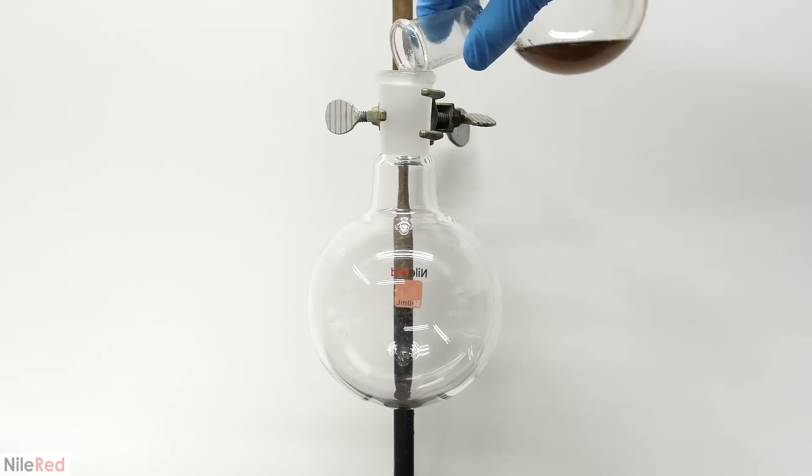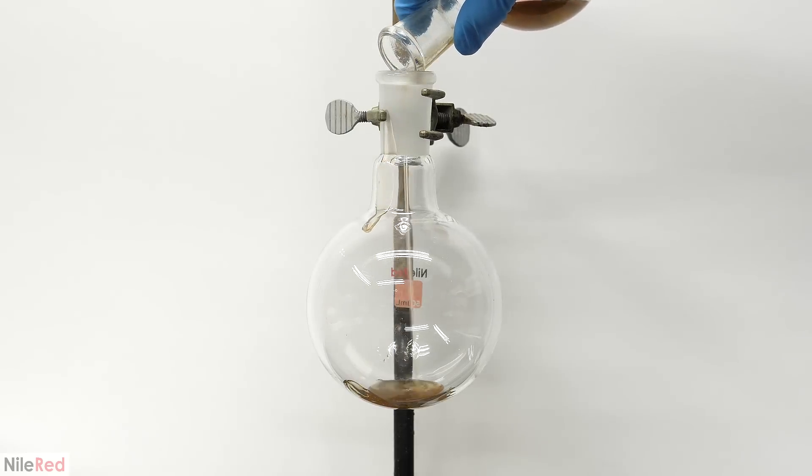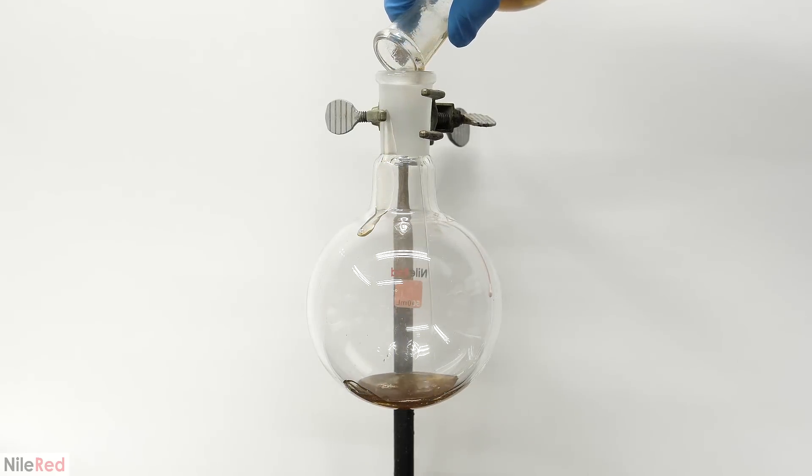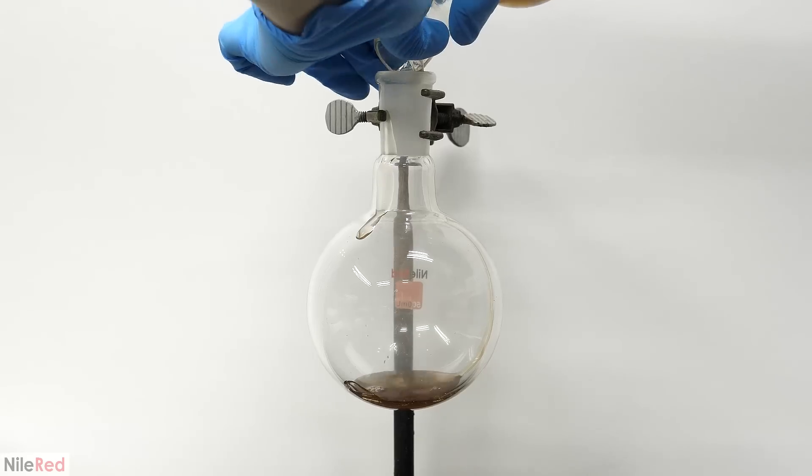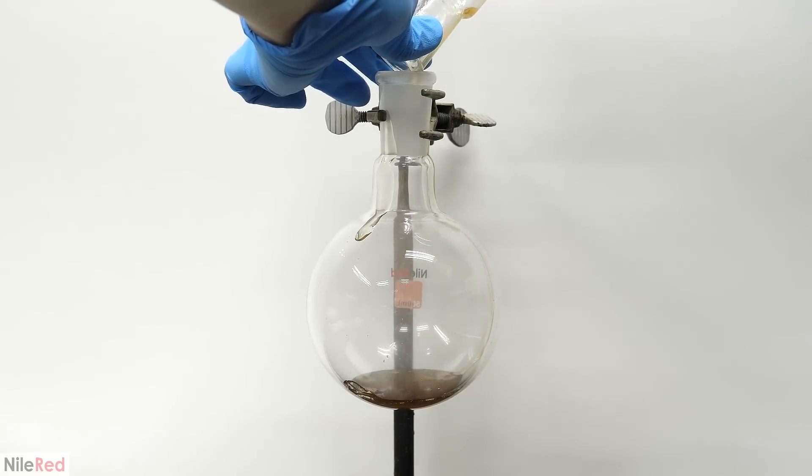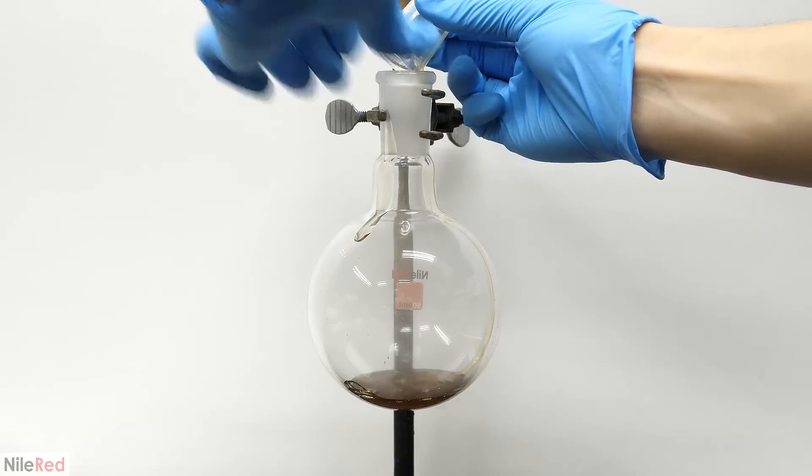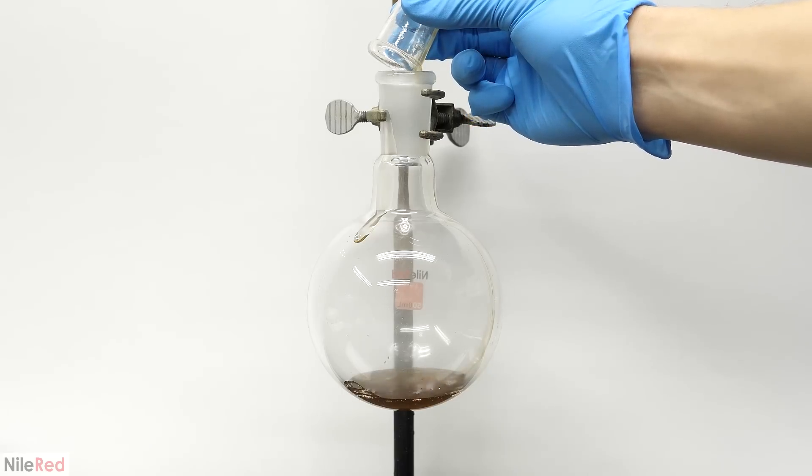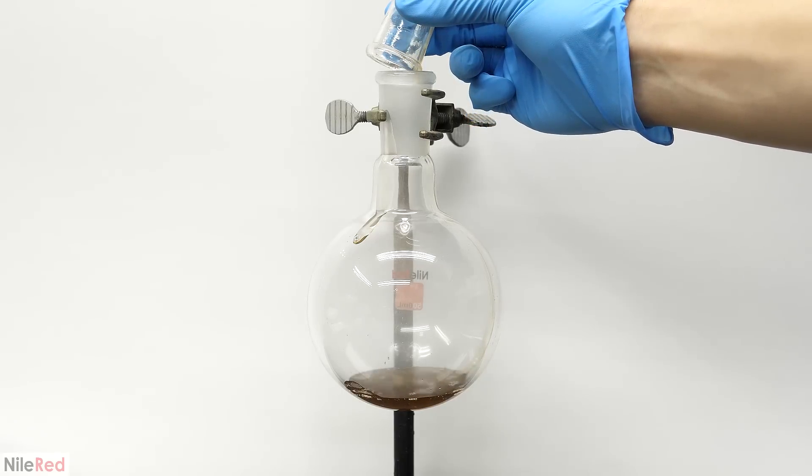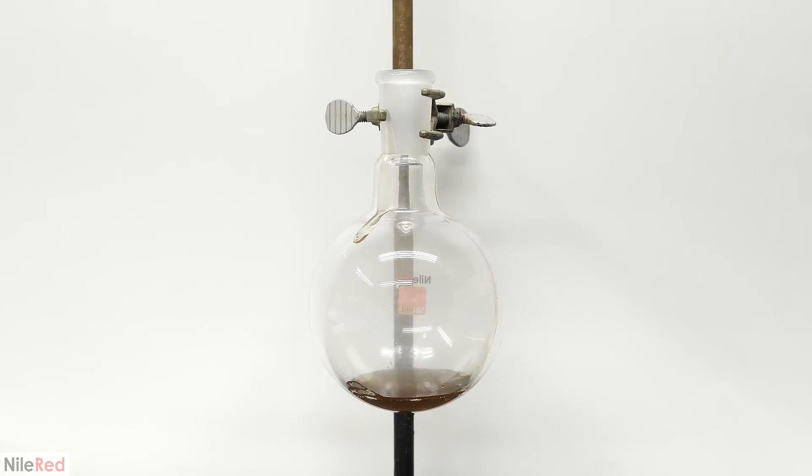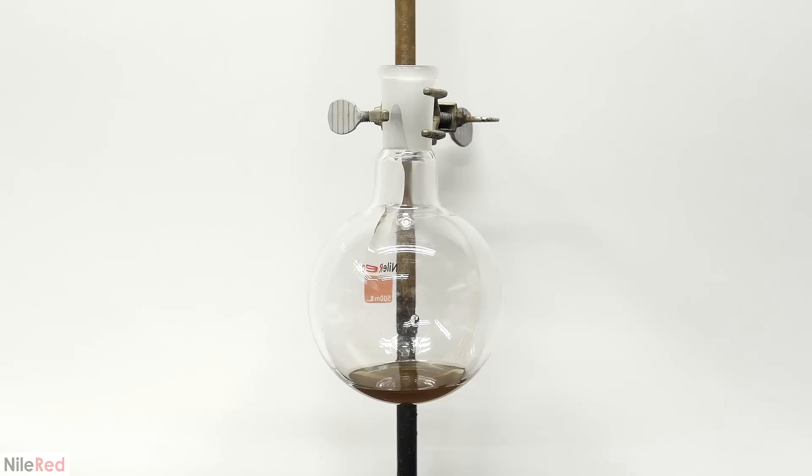For the next step, I had to get rid of the manganese catalyst, and I was originally planning to filter it. However, I found that it was a lot easier to just reheat the resin to make it a bit more liquidy, and then to pour it off into another flask. By doing this carefully and slowly, I was pretty much able to separate out all of it. When it was all in the new flask, I let it fully cool to room temperature.